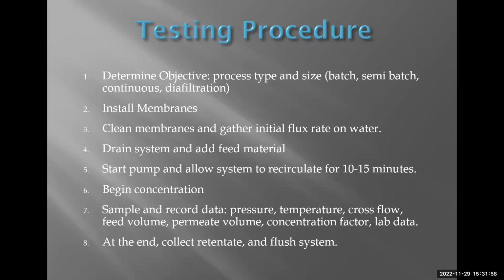The reason you wait 10 to 15 minutes is to build up a little bit of a filter cake on top of the membranes. Because if you were to take a sample immediately after starting the system, you're going to have very high flux rates, which are not accurate because the membrane doesn't have that filter layer over it, and no fouling. After the 10 to 15 minutes, you begin your concentration. And then depending on the style that you're running, you're going to sample and record your data.